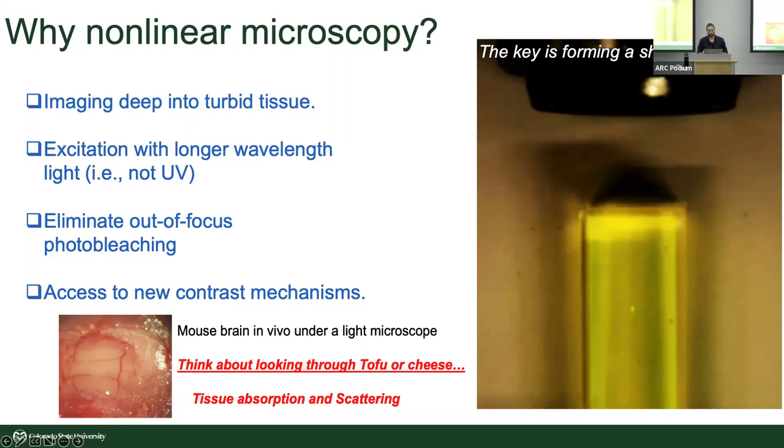Just as a quick ballpark, and this is, of course, just a quick rule of thumb, here in this building in the Translational Medicine Institute is an absolute top of the line confocal microscope that costs about half of what an entry level multiphoton microscope would cost. Most of that comes down to the laser. So if you're trying to design an experiment for multiphoton, you really need that. You have to know why you're doing it, I guess.